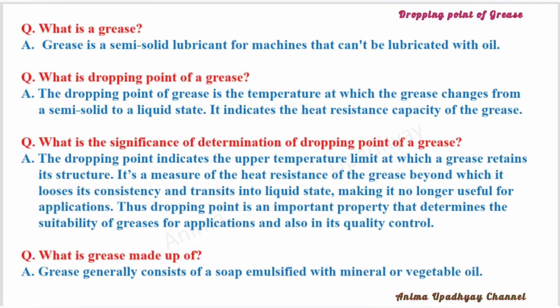What is the importance or significance of determination of dropping point of a grease? The dropping point indicates the upper temperature limit at which a grease retains its structure.